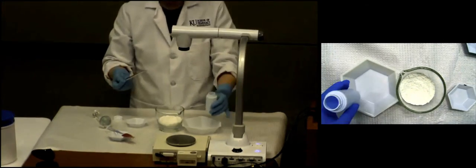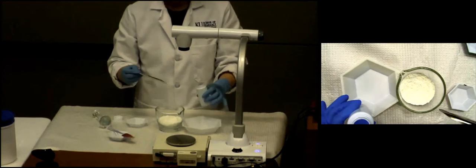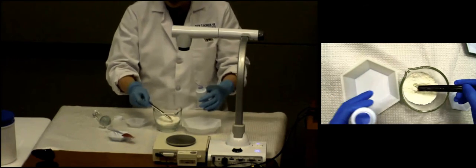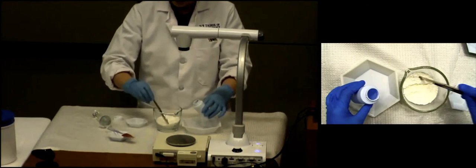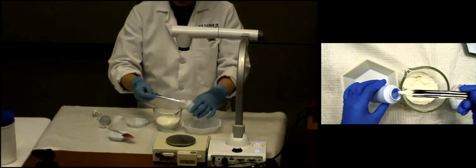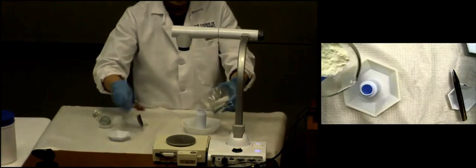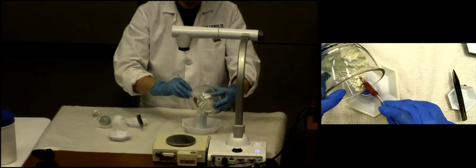Okay, all right, so I want to have a bigger weigh boat underneath my bottle, because I may have a little spill here and there. I don't want to lose any powder. I don't know whether I would have enough in the end or not. So you use your spatula and do a slow transfer one by one. All right, really take your time, okay? Now, I am running out of time, so what I'm going to do here is probably not the proper way that you should have learned.